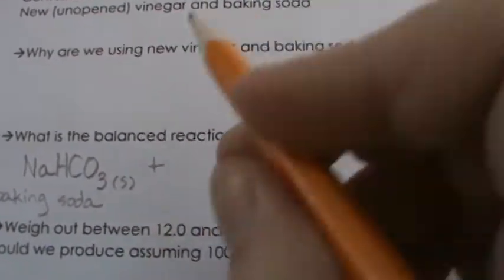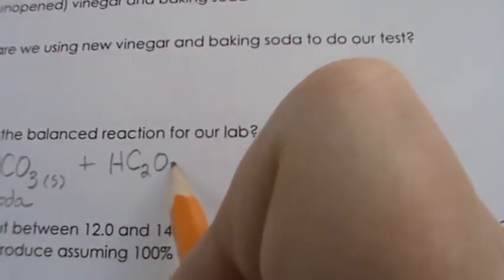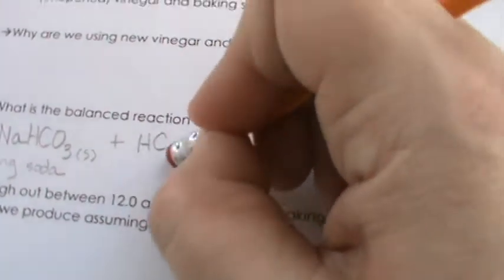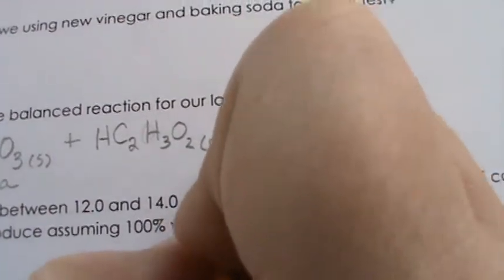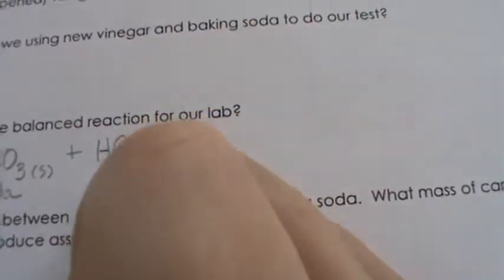And vinegar, and that is acetic acid, HC2H3O2, aqueous. So that means aqueous. So this is our vinegar.